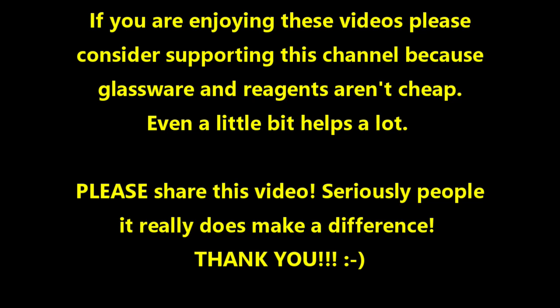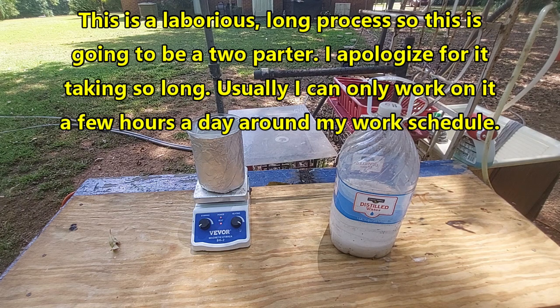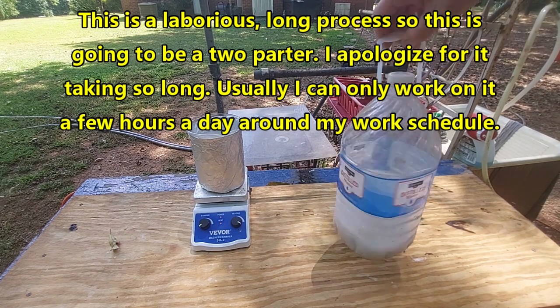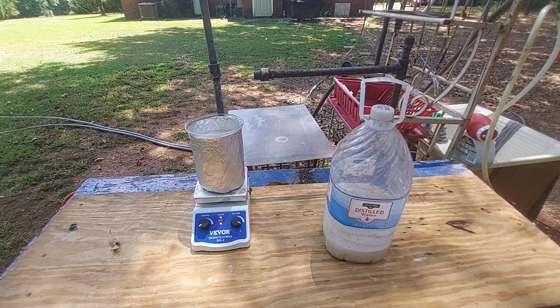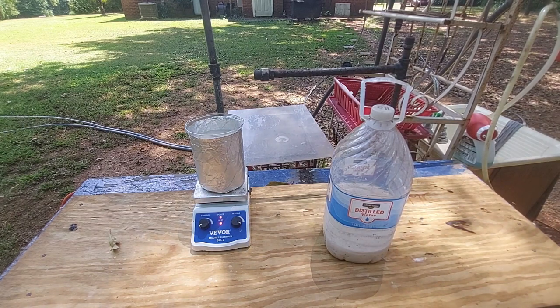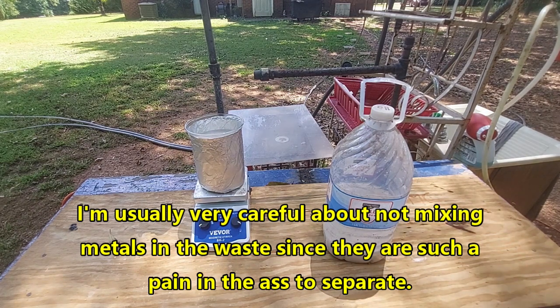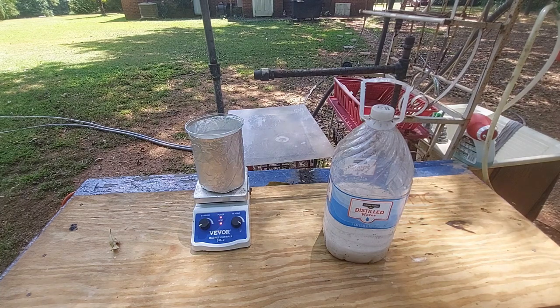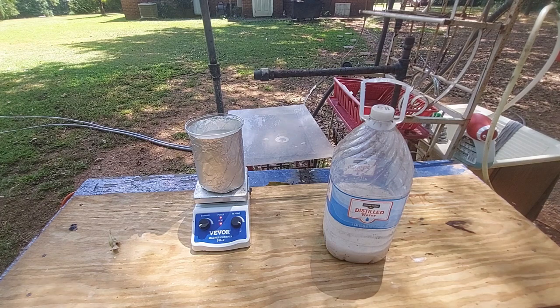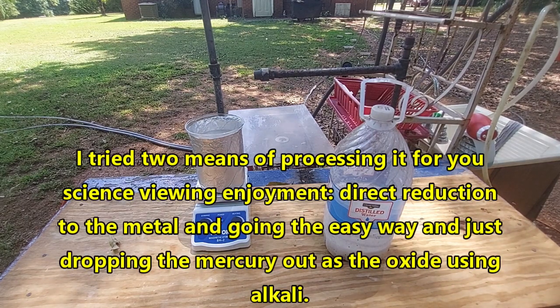Welcome to the Poor Man's Chemist. In this video we're going to be processing mercury waste. I've been working for the last few days evaporating it down — originally the container was almost full. I've been collecting mercury waste from every experiment involving mercury for years. I keep smelling acetic acid, so mercuric acetate experiment waste is definitely in there. Mercury has unique enough chemistry that this should be reasonably easy to pull off — I don't think I've added any other metals to it.